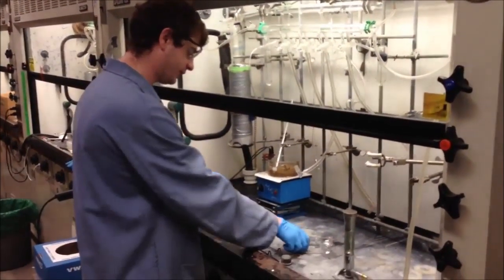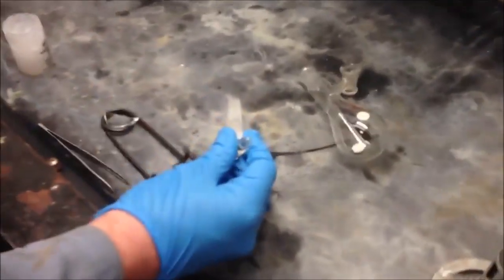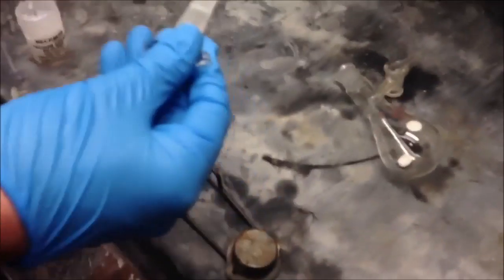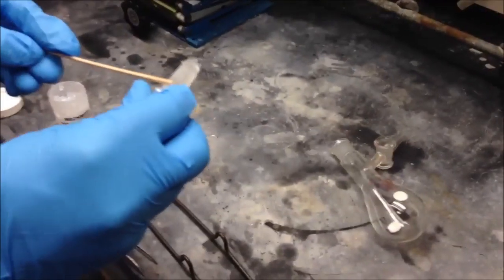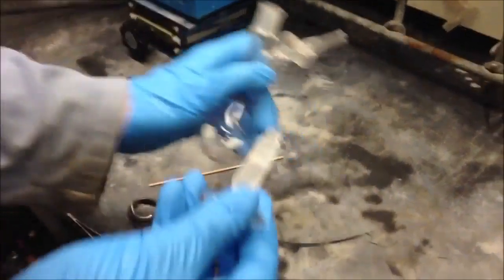I'm going to first grease the stopcock. So this is a small amount of vacuum grease, and this is going to ensure a tight seal between the glassware so that no air gets in.